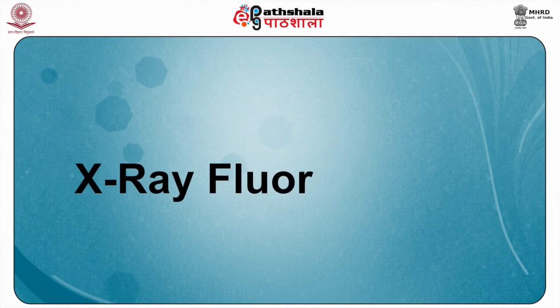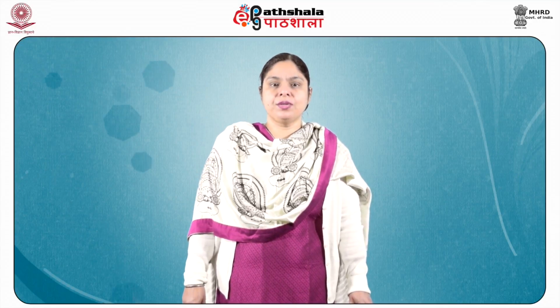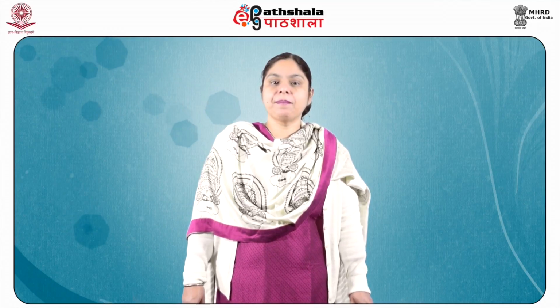Now coming to a brief sketch of the X-ray fluorescence technique, this is also a non-destructive technique which is very rapid and requires minimal or in fact no sample preparation. In this technique, an X-ray source is used to irradiate the specimen. As a result, the ionization of the atoms takes place, that is, one or more electrons may be ejected out of the atom, but the energy of the X-ray used to irradiate the sample should be more than the ionization energy of the sample.